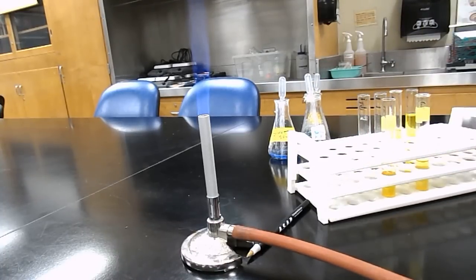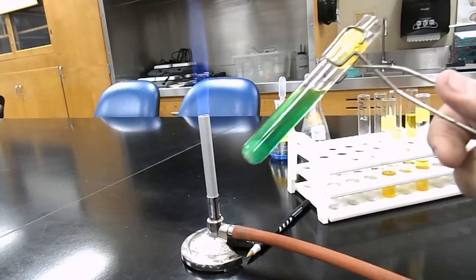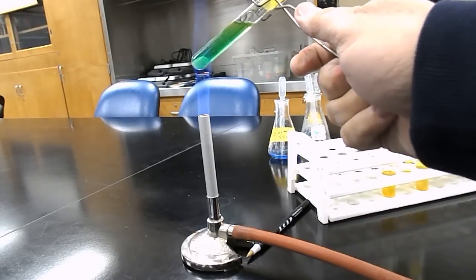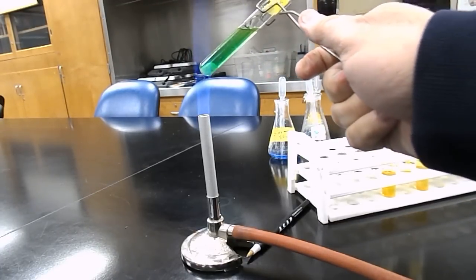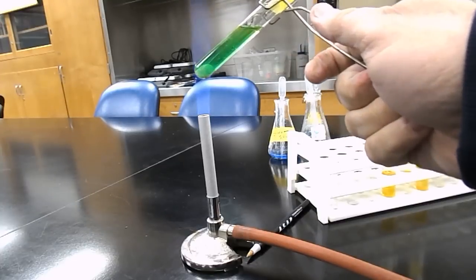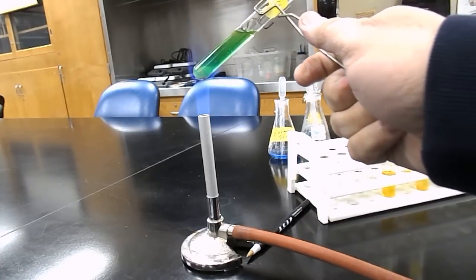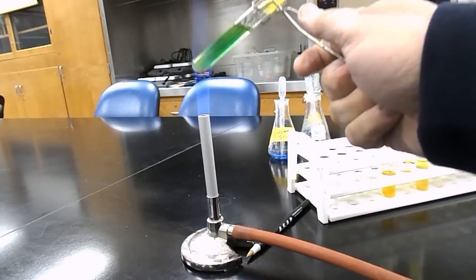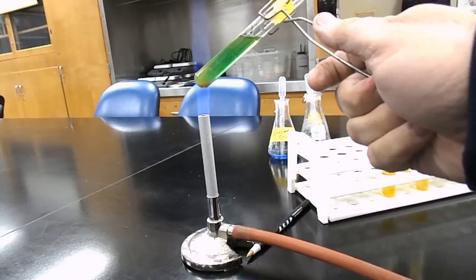We then add a boiling chip to make sure that the heated solution doesn't boil over and then we quickly move the test tube in and out of the flame at an angle, thus ensuring that there won't be any sudden bumping.